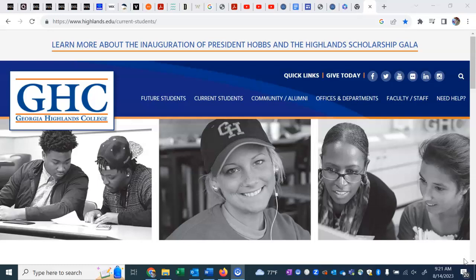I just want to give you a quick overview about how to handle setting up your digital lab notebook. Some of you may have never had to keep a notebook in biology before. Some of you have had to write in a composition book, or some of you have had to turn in lab reports. And we're going to try this digital lab notebook. We hope that you like it. And I'm just going to give you a quick how-to from this page.